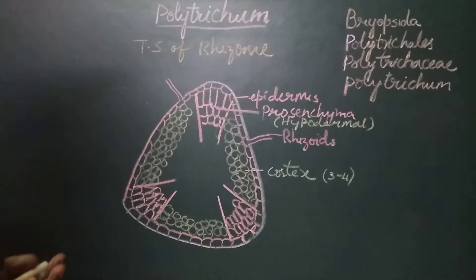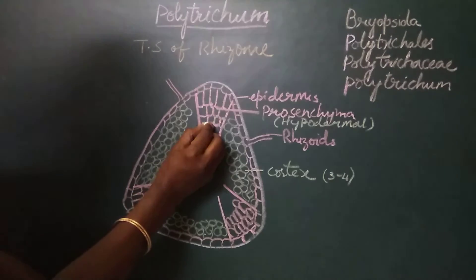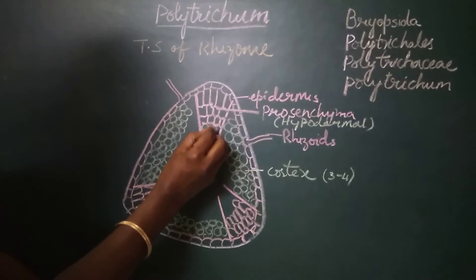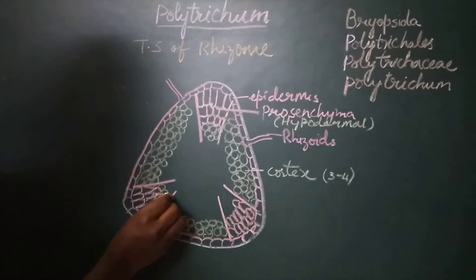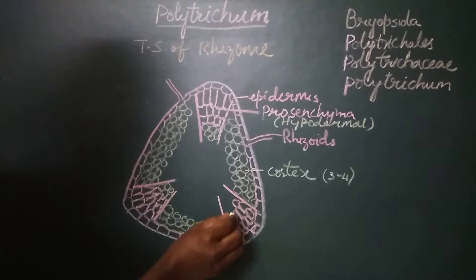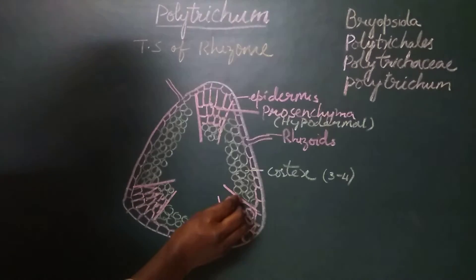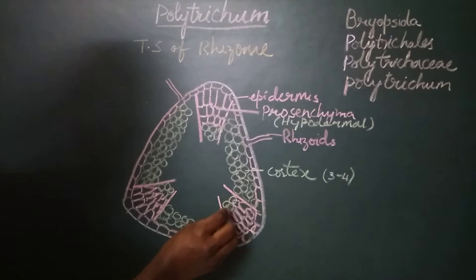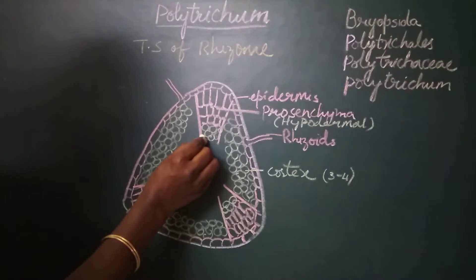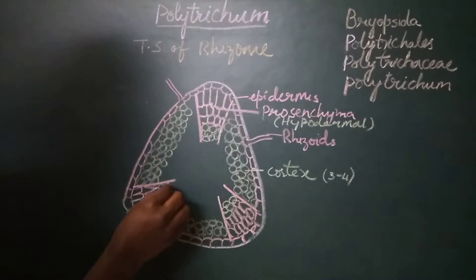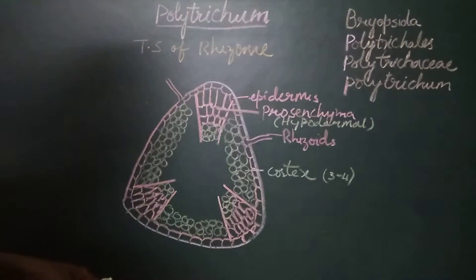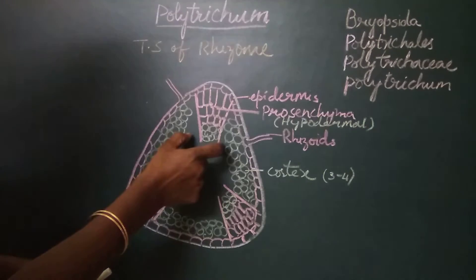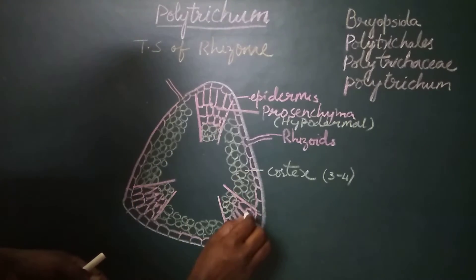Below the prosenchymatous hypodermis we find thin-walled cells. These have a larger diameter. The strand consisting of the prosenchymatous hypodermis and these thin-walled cells together is called the radial strand.